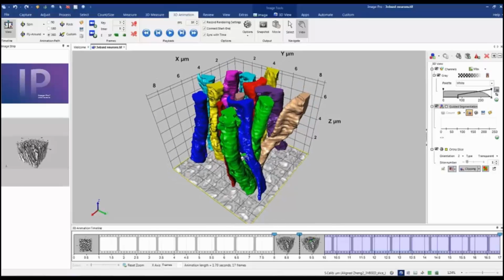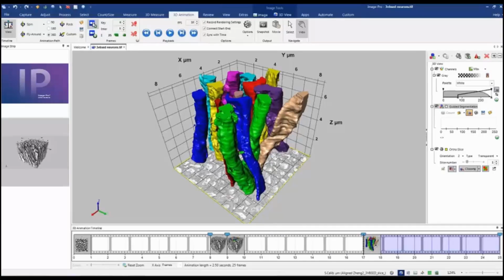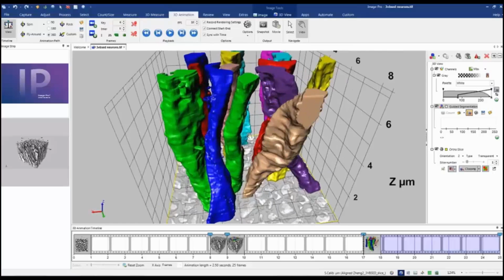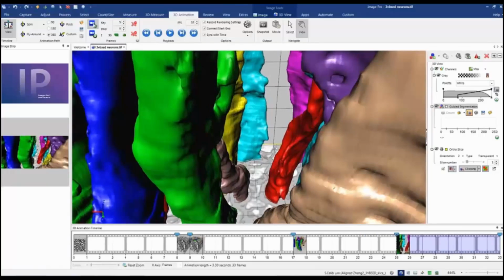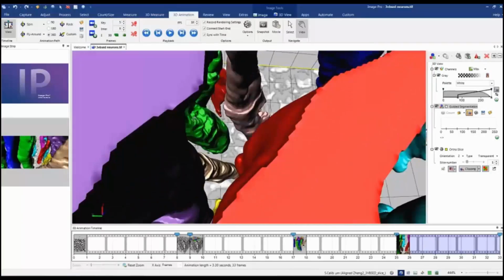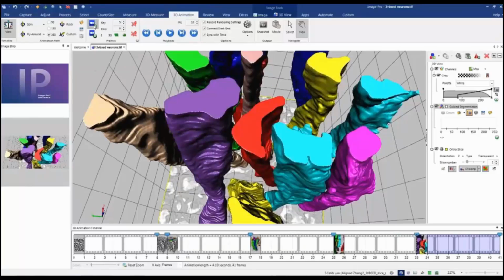At the same time, I can, for example, make it tilt a little, and I add another keyframe. So when it's created, we may create animation flying in a little bit just to get closer to neurons. We click this animation, and then we can, for example, move out and create the last frame.